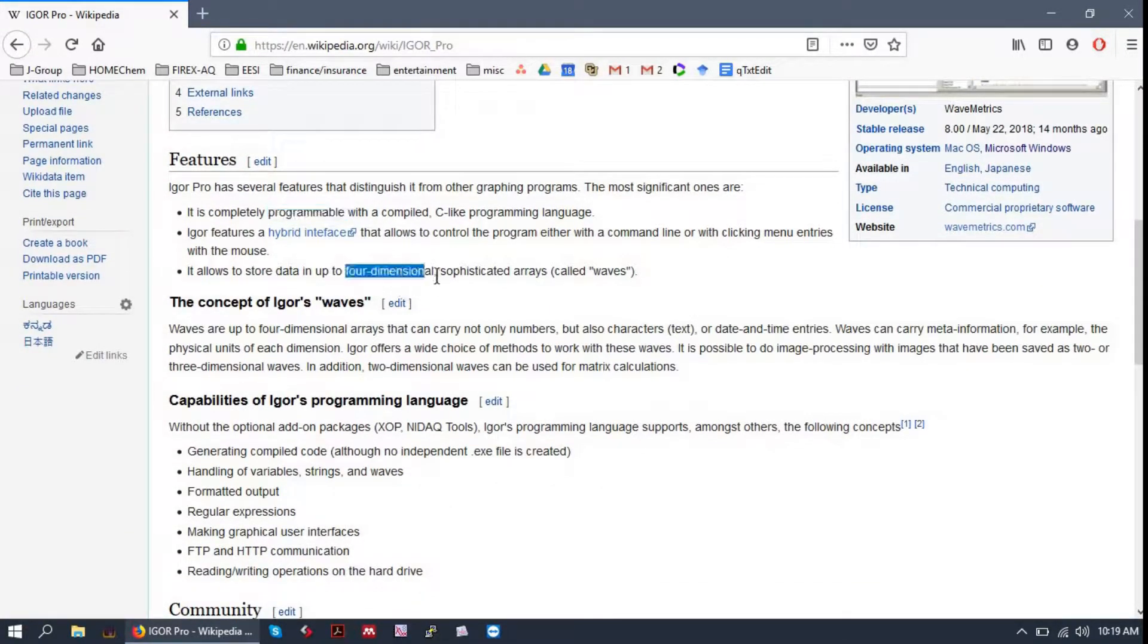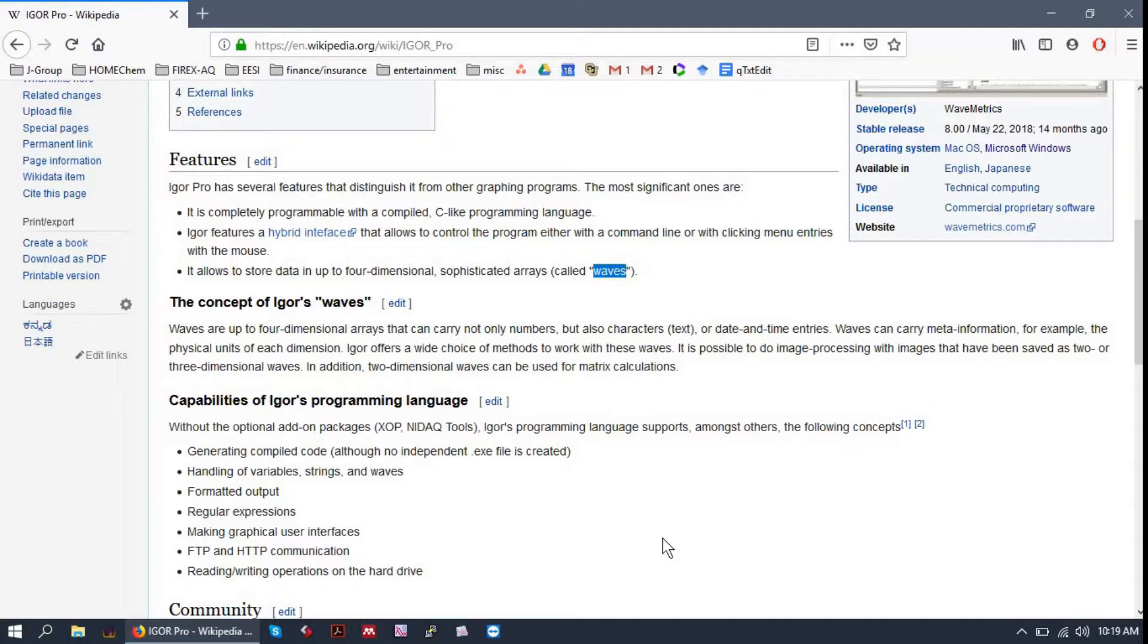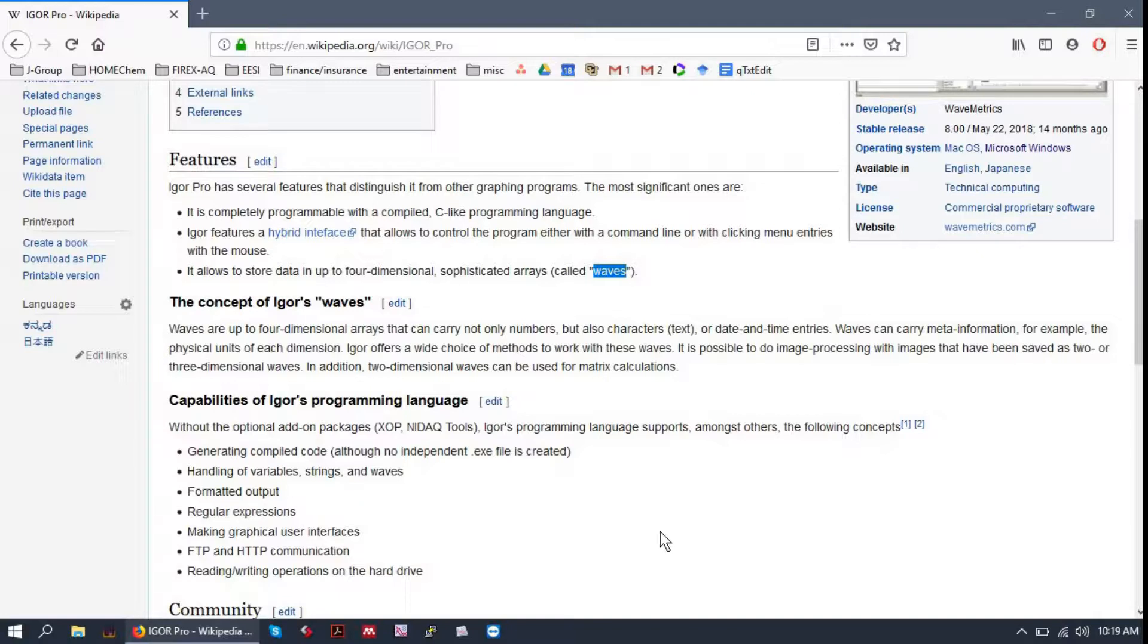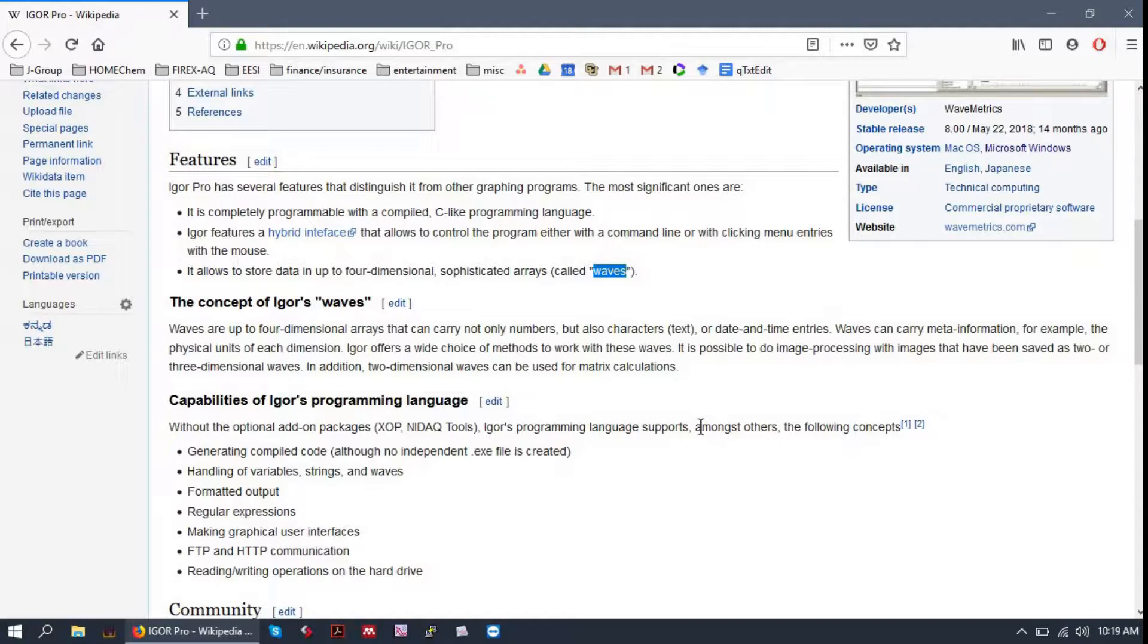It stores data in up to four-dimensional arrays called waves. And these are basically just regular old arrays, except that they can have metadata, dimension labels, unit labels, that sort of thing.